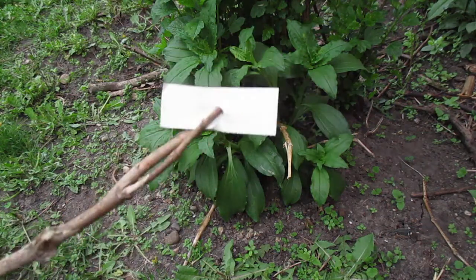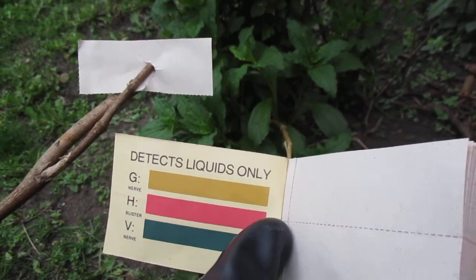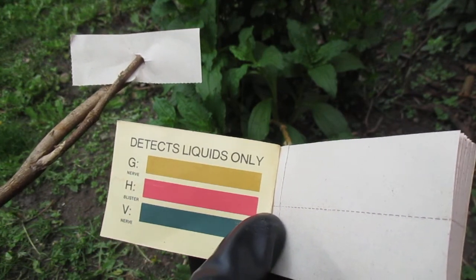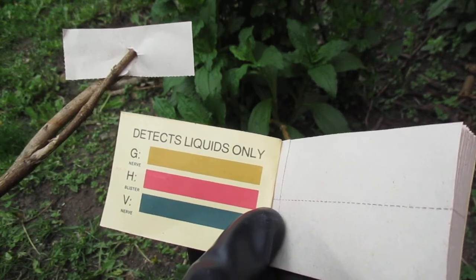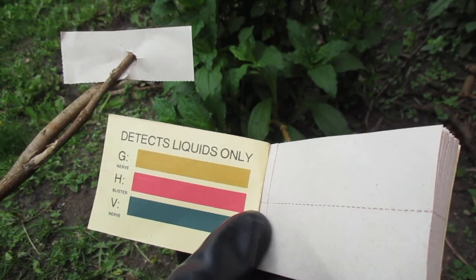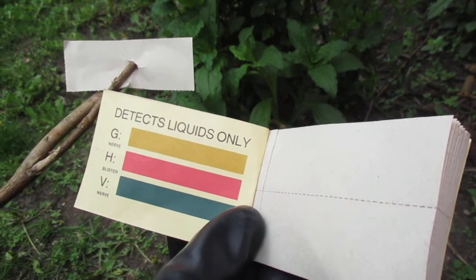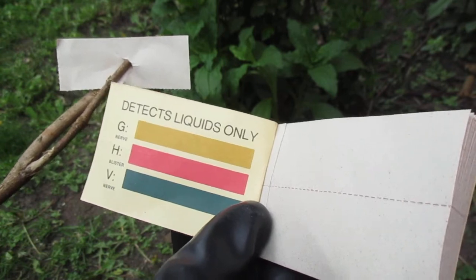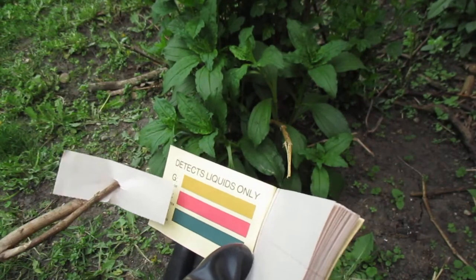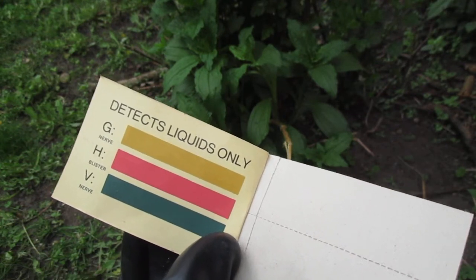The inside of the booklet shows that M8 paper can detect three types of agents: G-type nerve agents, H-type blister agents, and V-type nerve agents. G-type nerve agents show a yellow to golden color. H-type blister agents come out red to purplish in color on the M8 paper. V-type nerve agents come out green to bluish in color. You compare the reaction on the chart, and that tells you what type — or series — of agent it is, not necessarily the exact type.